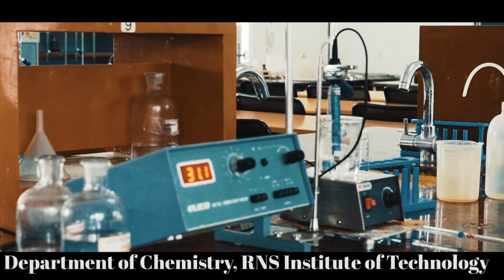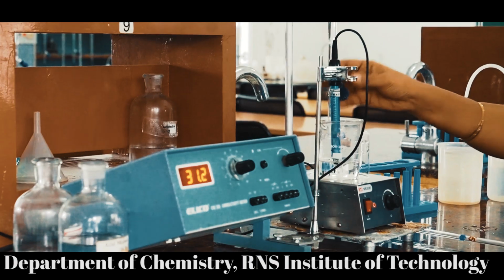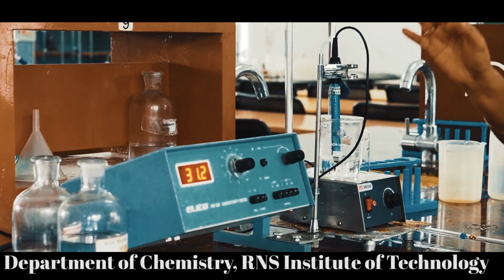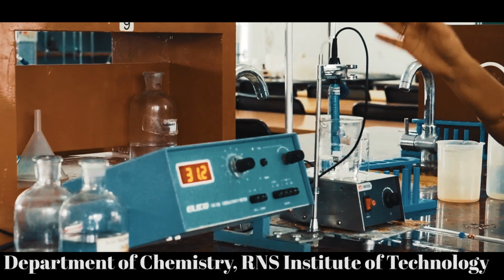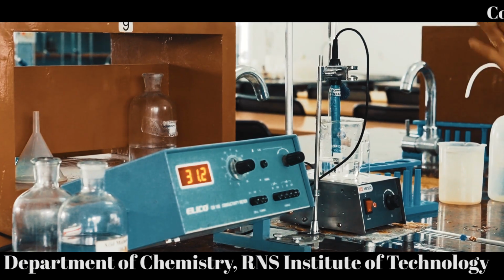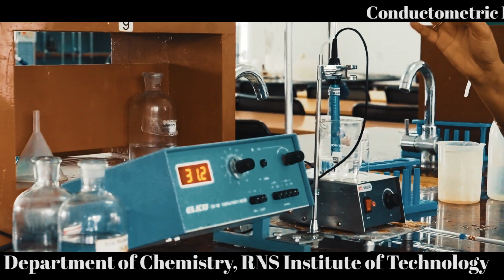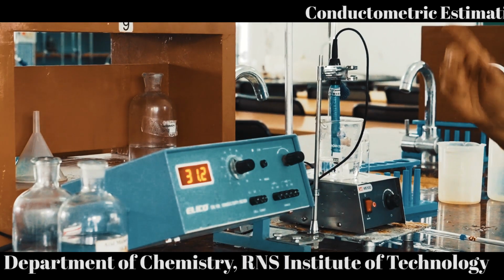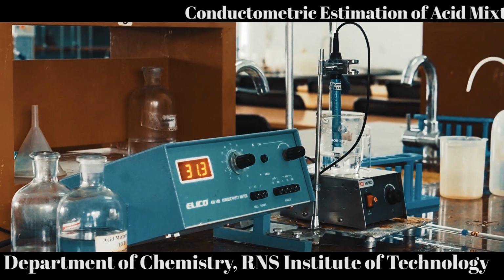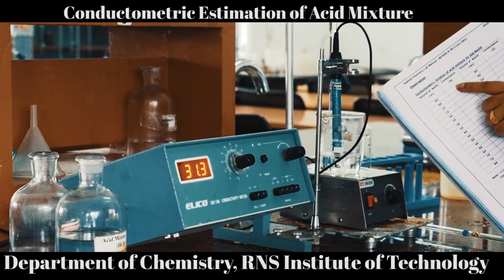Then we are going to start the titration. During the experiment, we are going to add the titrant in increments of 0.5 ml. Keep this in your mind. Before starting the experiment, the most important thing is we should note down the initial reading. The initial reading is around 31.2. This is very important because we should continue the titration and compare with the initial reading.